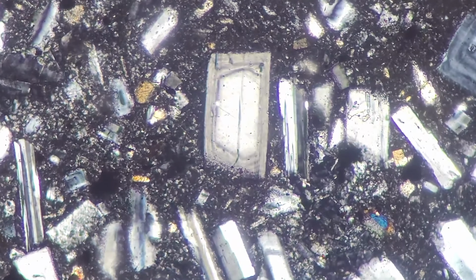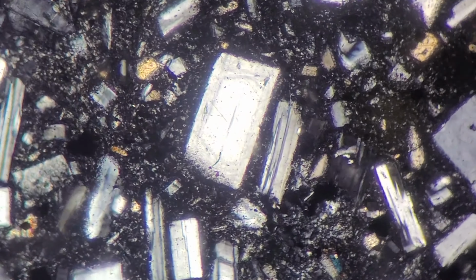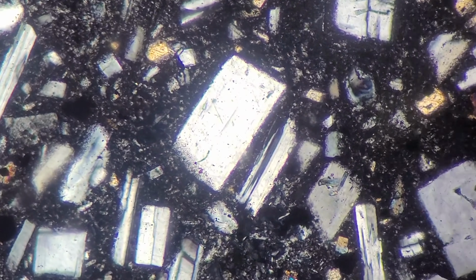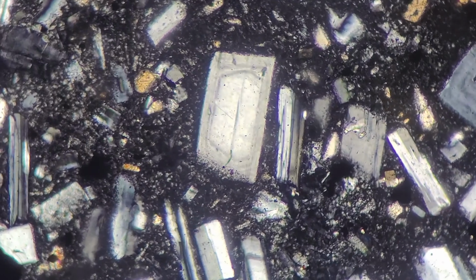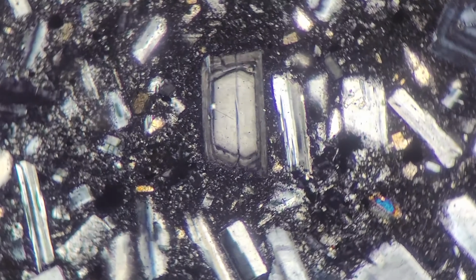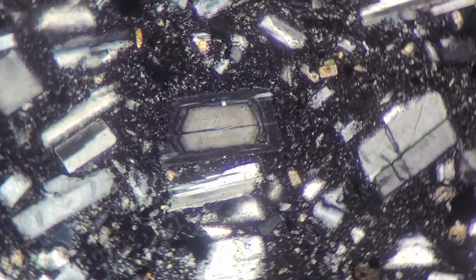Some minerals can also exhibit zoning, such as in this plagioclase, where zoning occurs from the core to the rim. This is best observed in cross polarized light, and is due to compositional variation within a single crystal, usually due to specific conditions such as rapid cooling during crystallization. This results in these rings of differing composition. In plagioclase, it's due to differing amounts of albite, which is the sodium end member, and anorthite, the calcium end member.